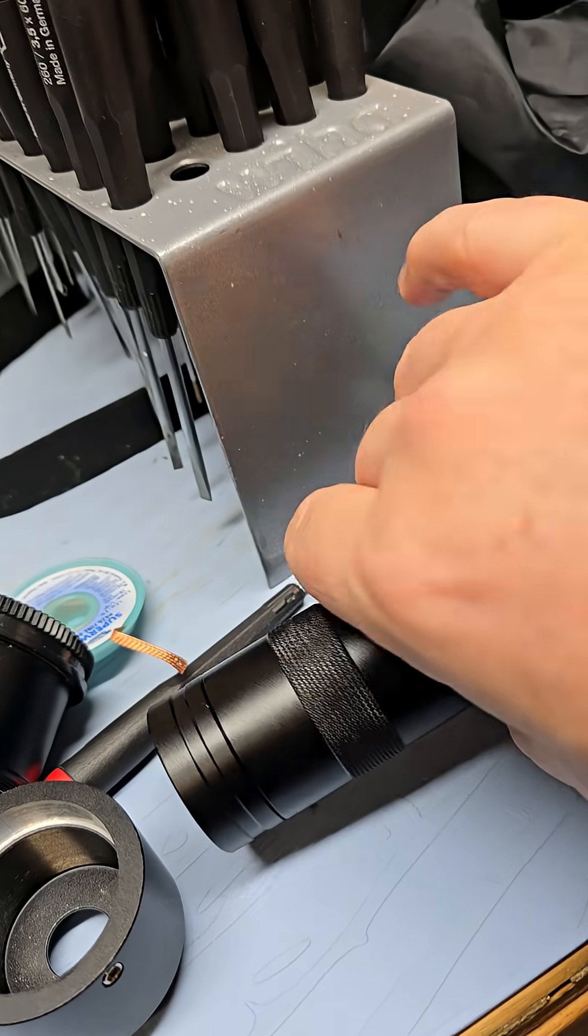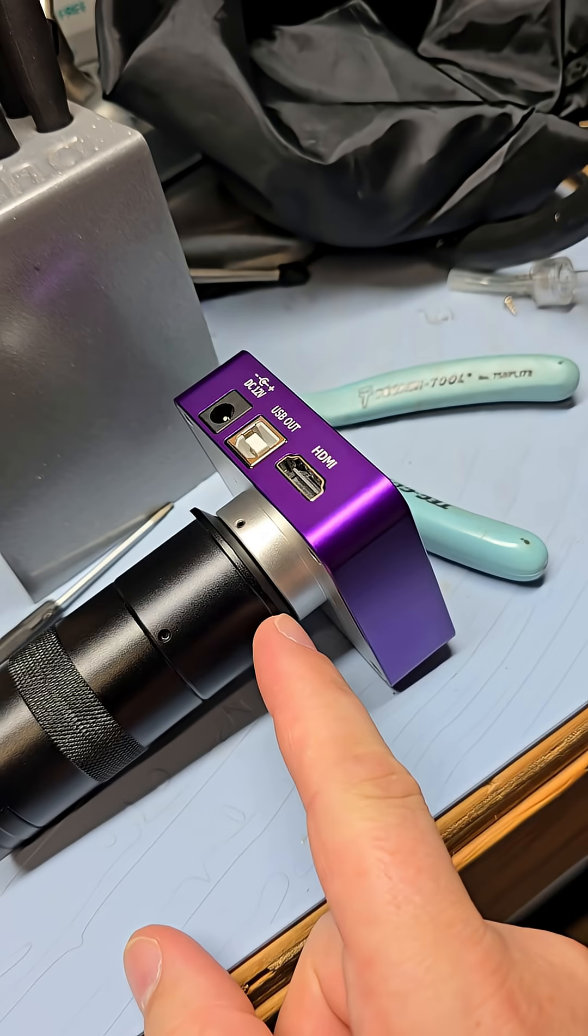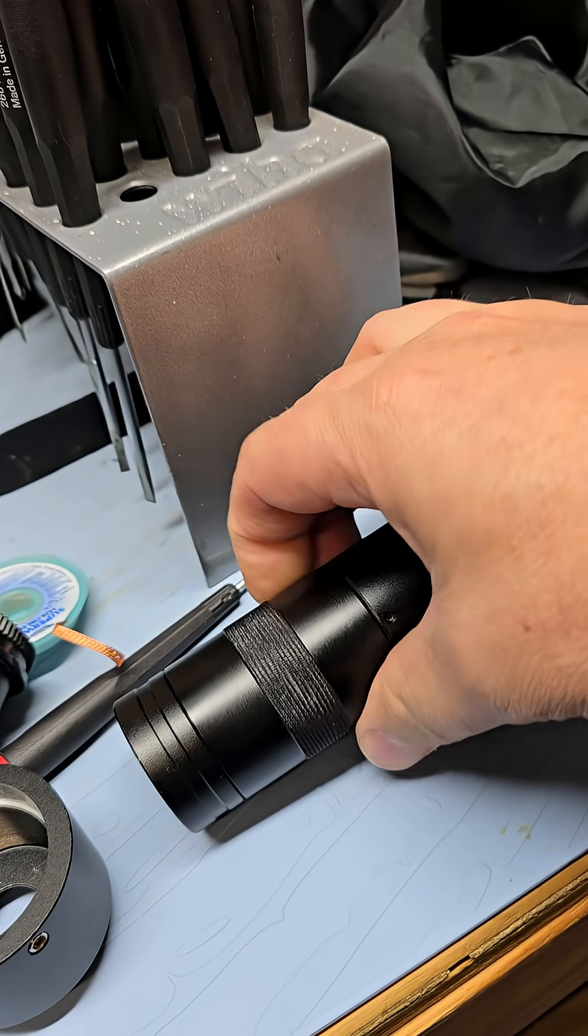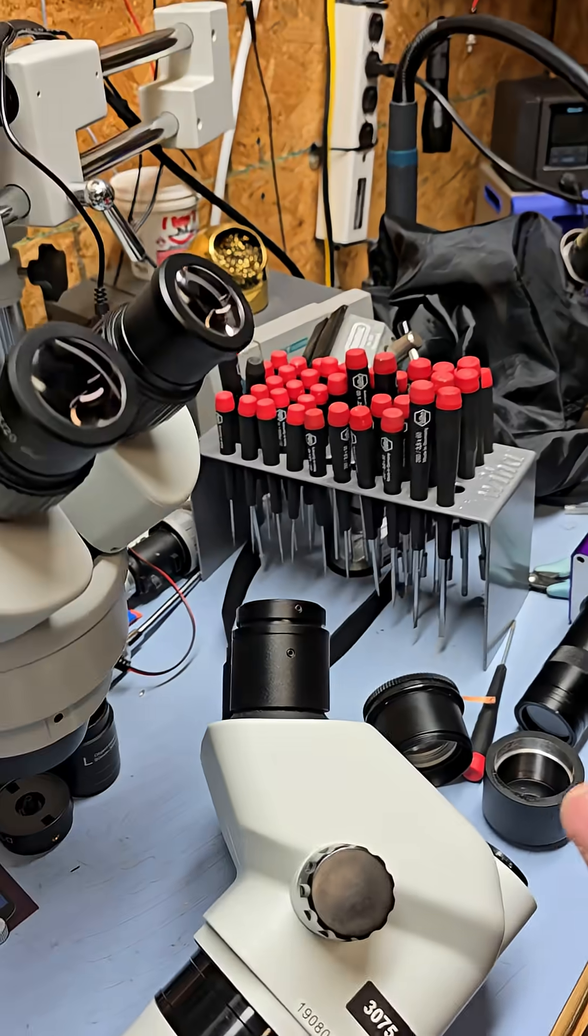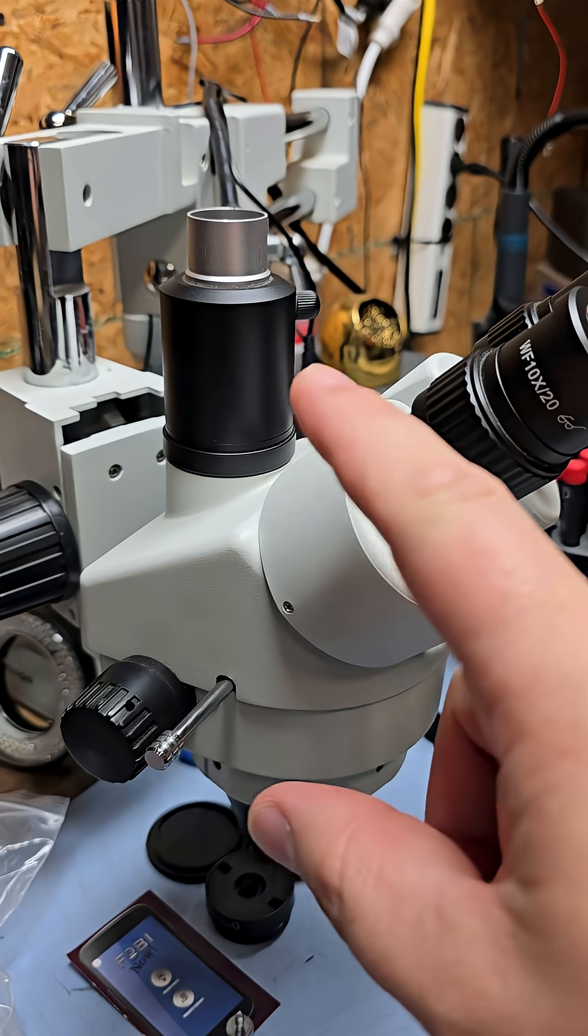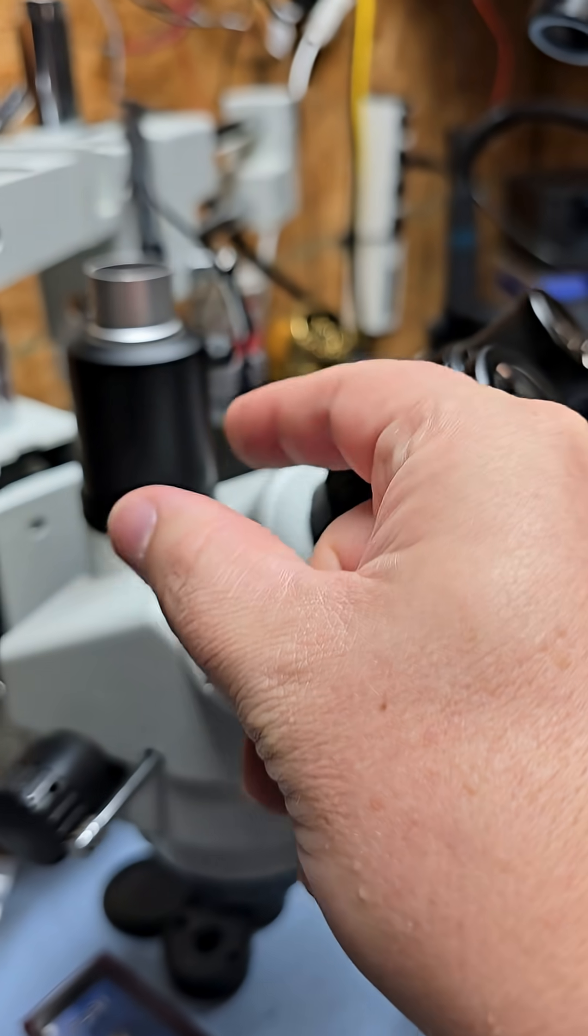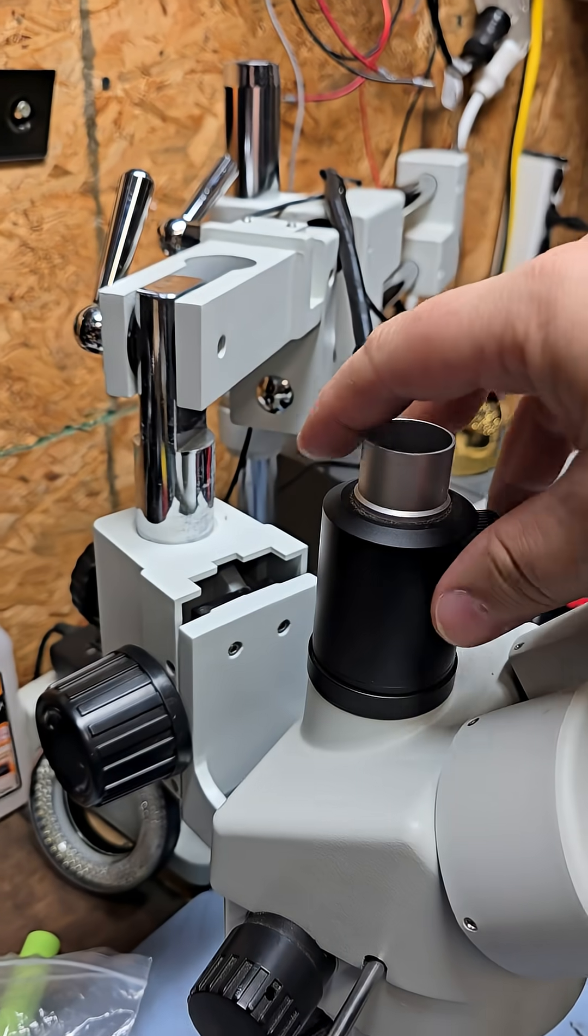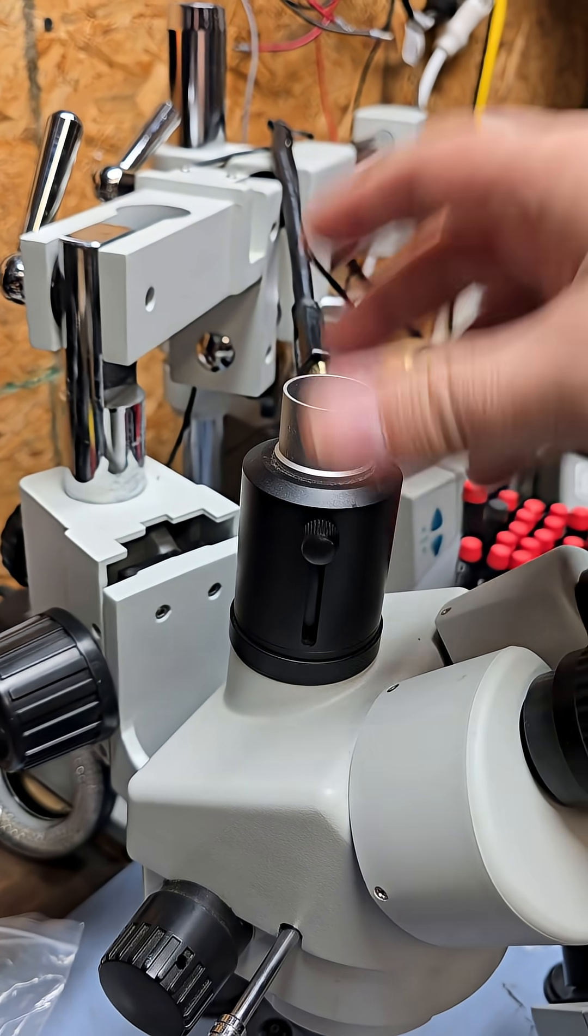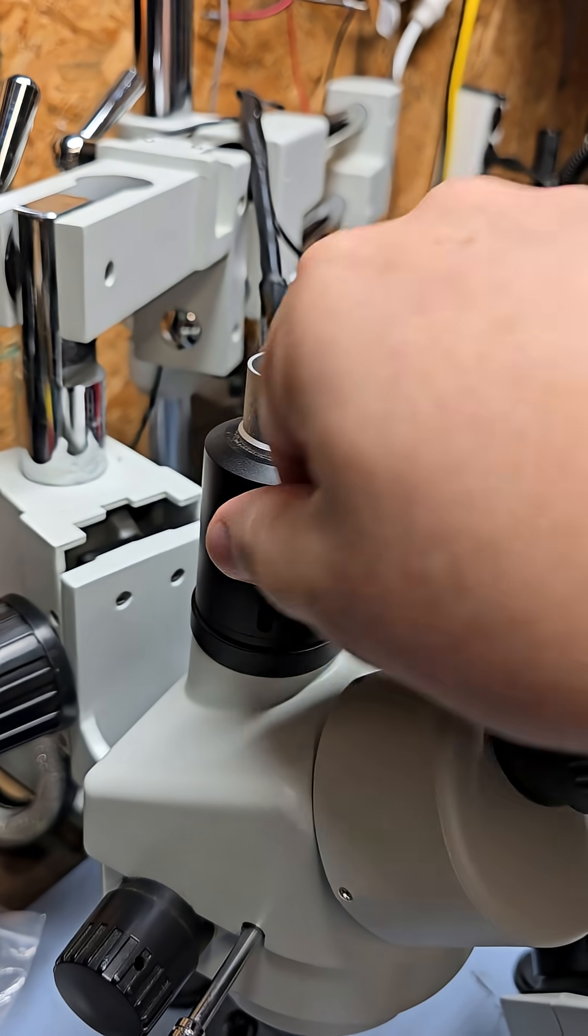And here's the crazy thing about C-mount, is that it will thread onto the camera and it's got a focusable base like this one. And the big part is you have like 0.5x and you have 0.35x. And that is going to be basically the amount of light that you're going to hit your camera sensor. And it's also your zoom or your focal length or whatever you want to call it.